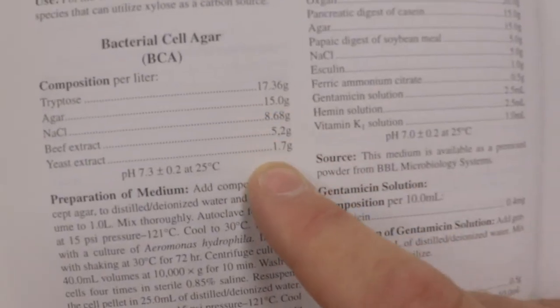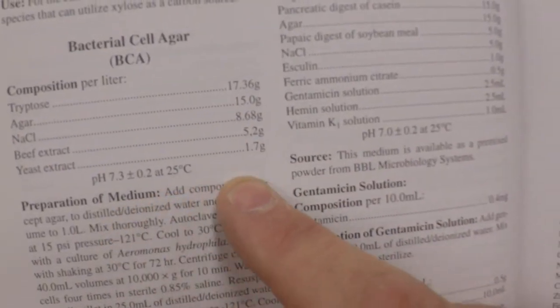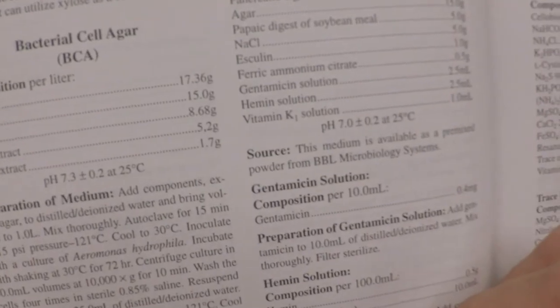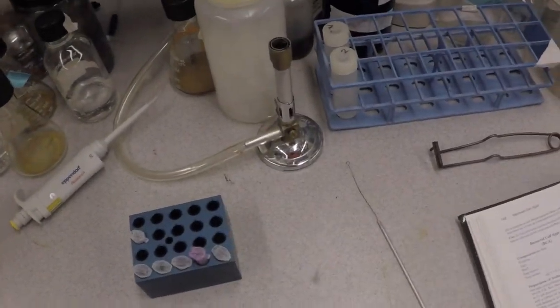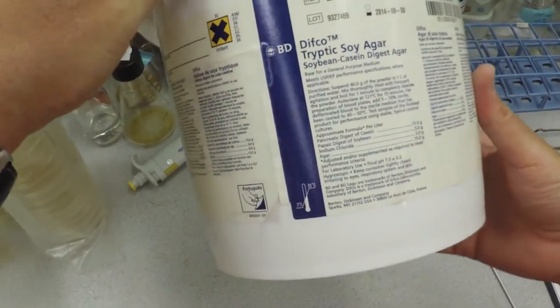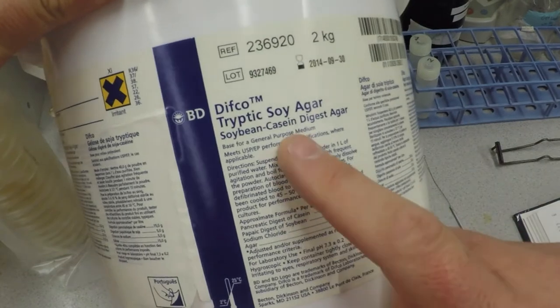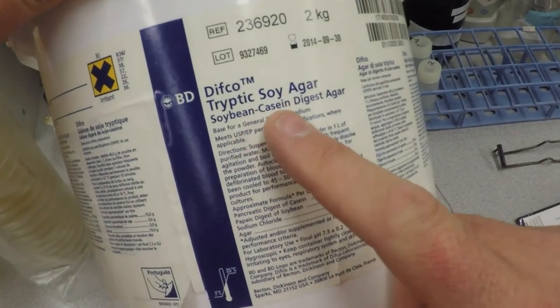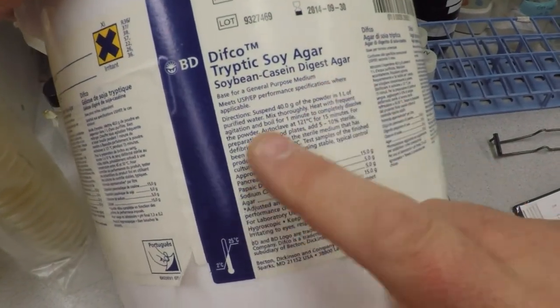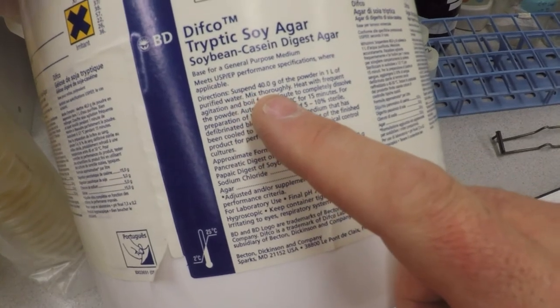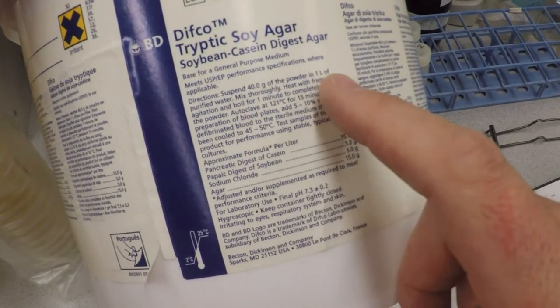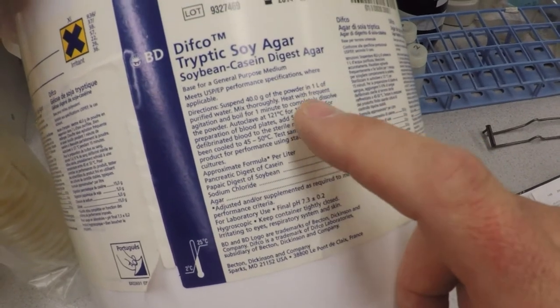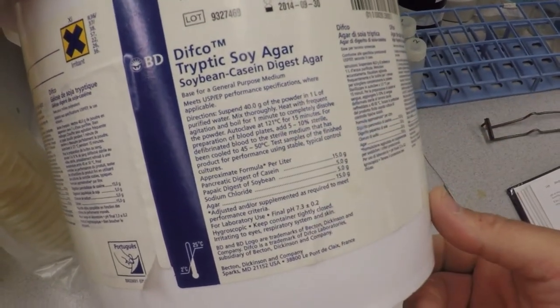Let's go over and look at tryptic soy. Take a little stroll over here. Here it is. It says tryptic soy agar—soybean casein digest agar. If you read these little directions, it'll tell you what to add and how much. It says 40 grams of this powder into a liter of water, mix it, autoclave and sterilize it.